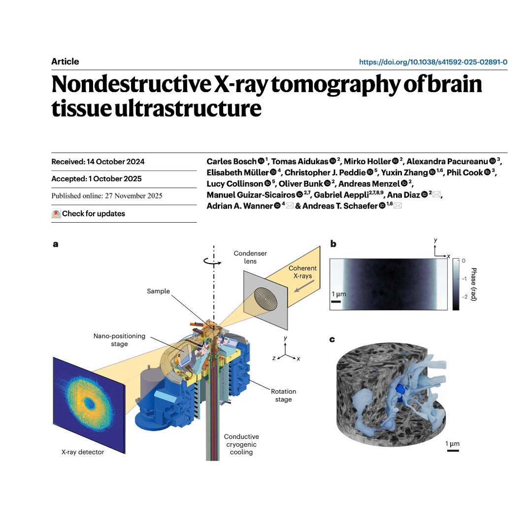So they needed a computational way to fix motion that was happening during the scan. And here comes the computational gymnastics. This is the third pillar, right? The nonrigid tomographic reconstruction algorithm. How can software fix a physical warp that happened inside a frozen piece of tissue? Well, a standard 3D reconstruction assumes the sample is perfectly still for the whole scan, the full 0 to 180 degree rotation. Okay. The non-rigid approach just throws that assumption out.